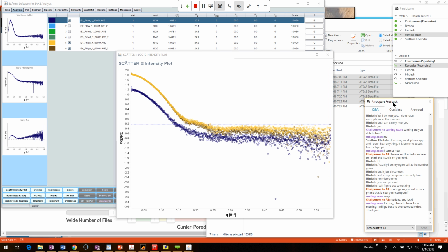And that's all automated in Frame, or is supposed to be. Again, there are bugs, and people have complained about exactly what you're saying before, and I probably need to go through that error bar process again. But if I were to give you some advice, if I were having trouble with error bars, I'd just assume like a 3% error bar across the whole thing and just apply that. For most of what you're doing, that will work, and you won't have to worry about these discontinuities or whatnot.